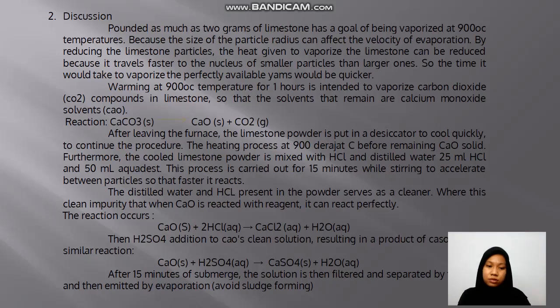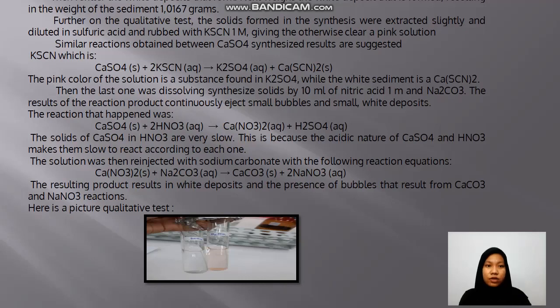After 15 minutes, the soaked solution is then filtered and separated by filtration and then concentrated by evaporation. Then filter the white deposit that formed. Next, weigh the white deposit that is formed, resulting in a sediment weight of 1.0167 gram.